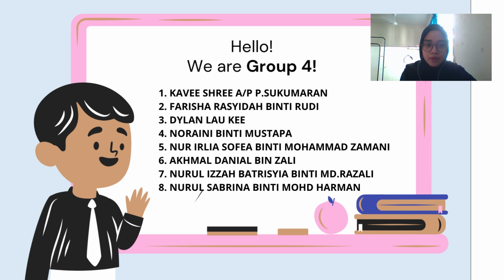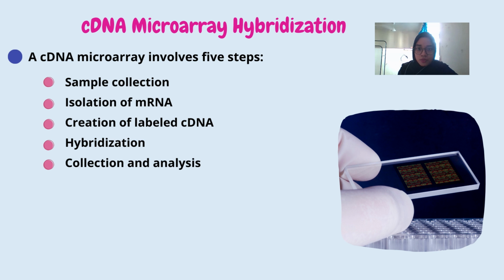Today we are going to present about cDNA microarray and real-time PCR using Scorpion Primer. First and foremost, we need to understand the steps involved in cDNA microarray, which are sample collection, isolation of mRNA, creation of labeled cDNA, hybridization, collection, and analysis.